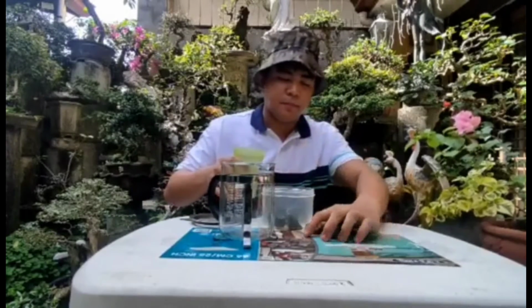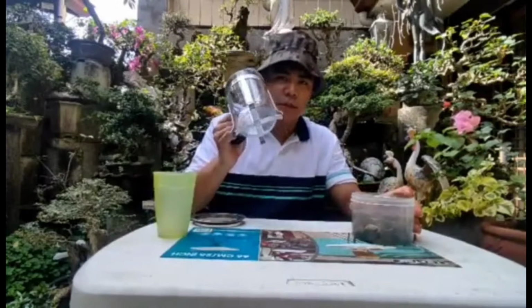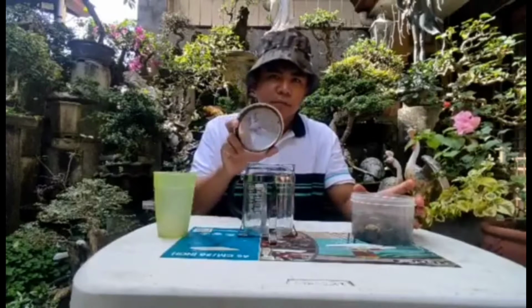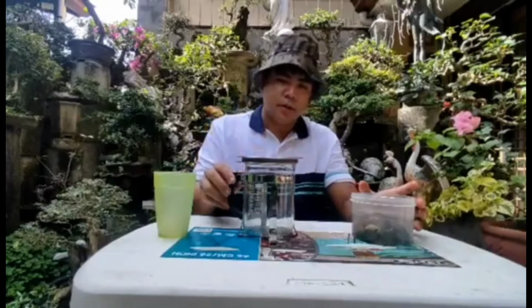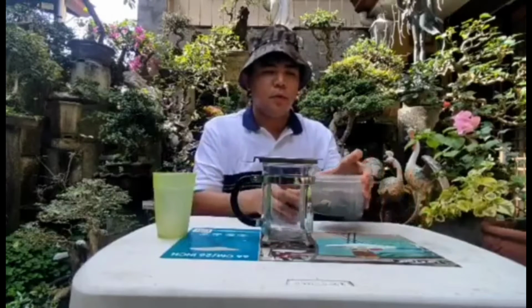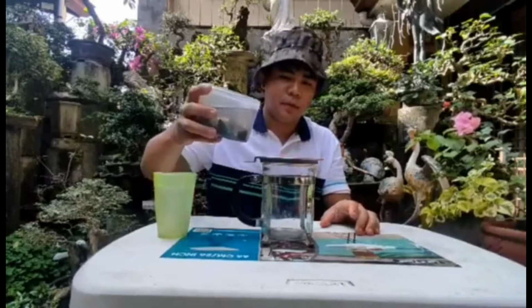The first procedure will be, let's mix the water and gravel in an empty container. The second step will be, take this empty beaker. Then the third, put the sieve or the filter on top of the empty beaker. Then we pour the mixture of gravel and water onto the empty beaker with its filter, just like this.